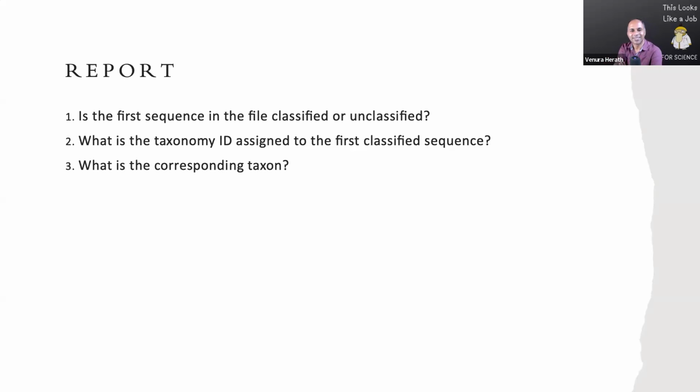Okay, only one person answered so far. Others?